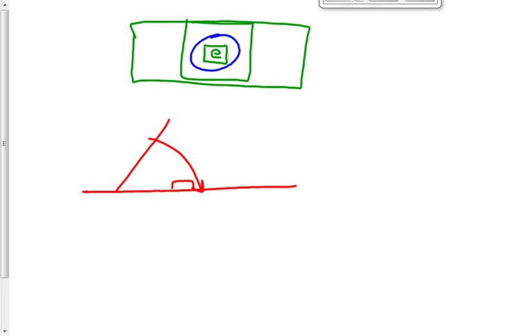And the cover slip will stay on. Why will the cover slip stay on? Because water is a polar molecule. Think about that. Might be important later. So yeah, it'll stick on there. Really good. Won't come off, and it keeps you from getting the lenses wet. That's the purpose of a cover slip. Lots of times the lens will actually touch the slide, and obviously if you didn't have a cover slip on, then it would get goo all over it all the time. We don't want that. So that's the purpose of the cover slip. It's transparent. It won't affect anything.